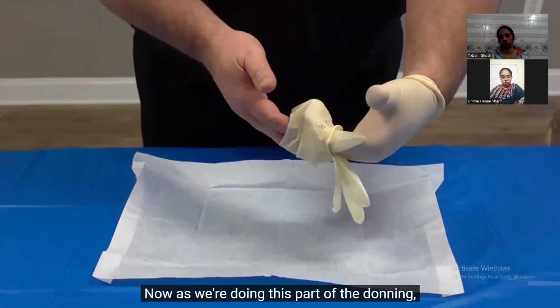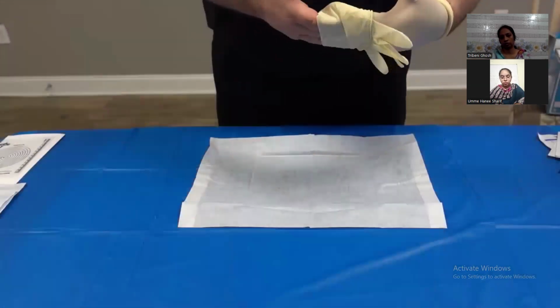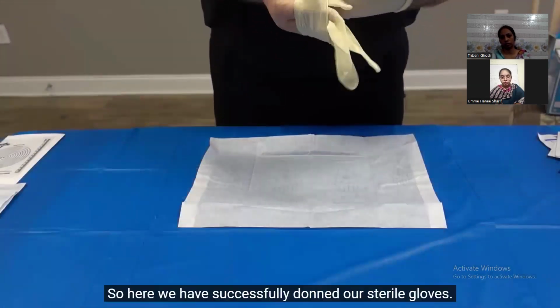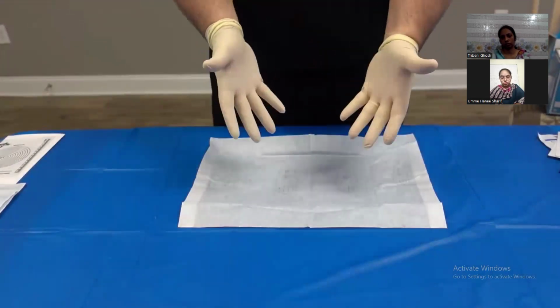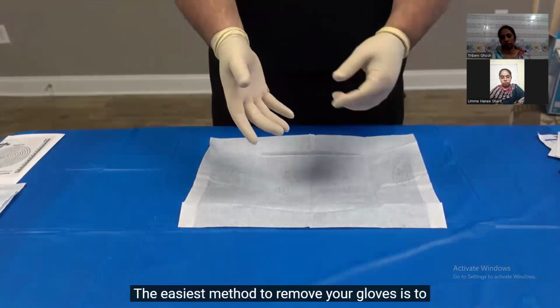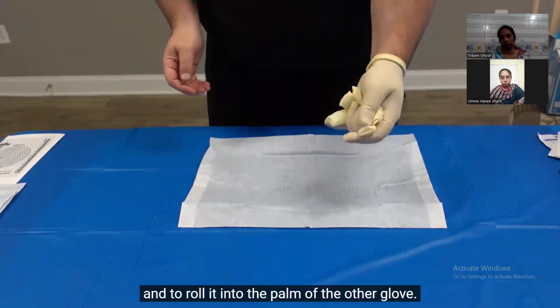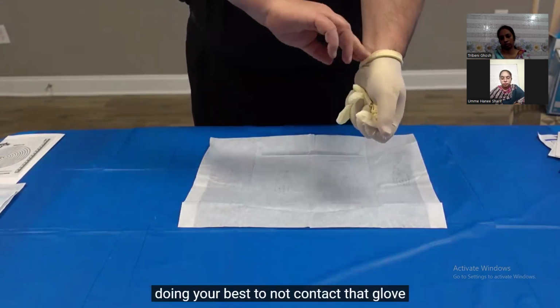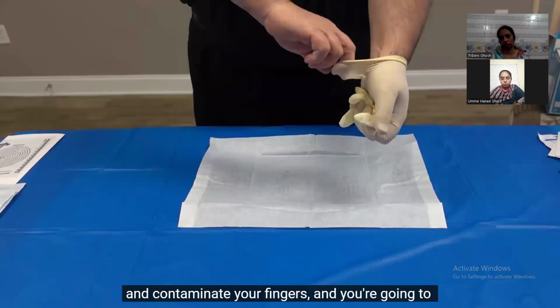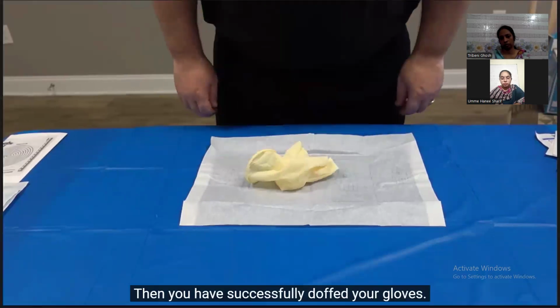As we do this part of the donning, we want to make sure we do not let our sterile thumb come in contact with the non-sterile surface of our other glove. So here we have successfully donned our sterile gloves. Now it's time to remove them. The easiest method is to pinch one glove in the palm, gently pull it off, and roll it into the palm of the other glove. Then slide your fingers inside the cuff, doing your best not to contact the glove and contaminate your fingers. Pull it inside out so you retain both gloves inside. And you successfully doffed your gloves.